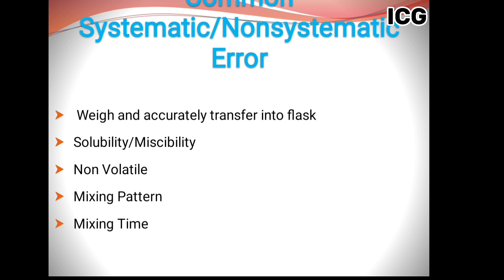Now we will discuss some common systematic and non-systematic errors. Number one: weigh accurately and transfer into the flask — this is the first and most important step. Most of the time the analyst either does not weigh correctly, or even if the weighing is correct, the transfer is not done properly. This is where the error starts. Even if you work accurately afterward, since you have already introduced an error at the first step, that error will move in parallel throughout your results.